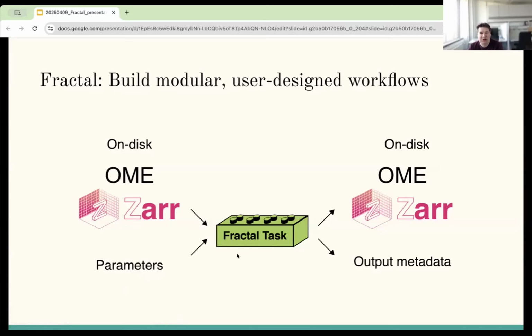They do some processing, some image processing, some segmentation, some measurements, and they put the result back into an OME-Zarr container. Given that everything, once it's converted, goes OME-Zarr to OME-Zarr, these really become Lego pieces that are interchangeable: you can use one, and then you can use another one that someone else built that works on the same standard data form.